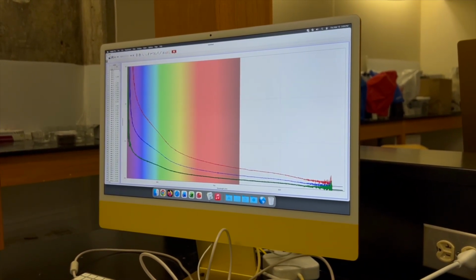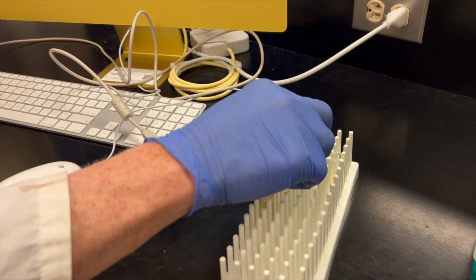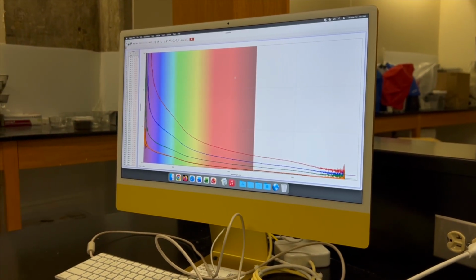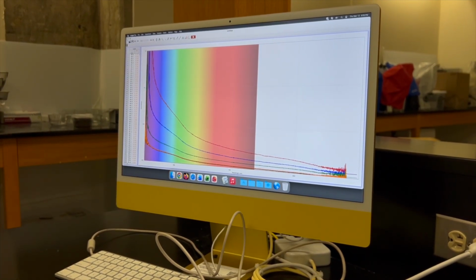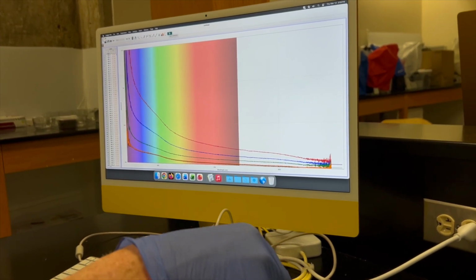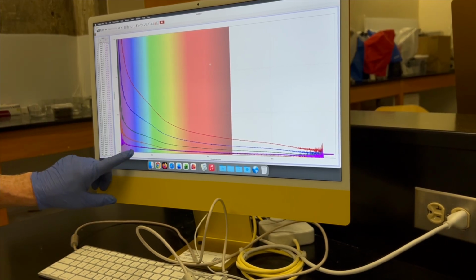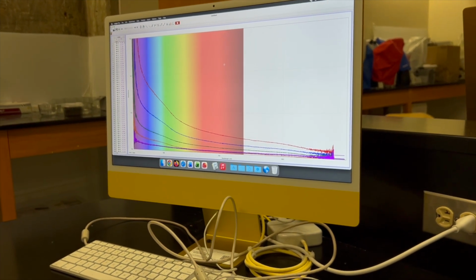All right, we will hit stop again. Take this one out. Put this one in. It's nice and clean. We'll hit play, store latest run. Nice, reduced again. So biggest reduction, less and less. As we're going in, we can see that reducing even more. And finally, we will hit our last one. We will hit play and store latest run. And we can see this one's kind of bottomed out here. It's kind of even right there, just a teeny bit down.